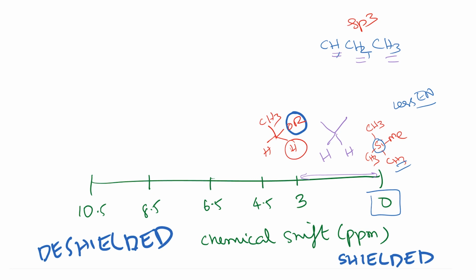So, this is the region where typically olefins show up. Okay. So, where you have R, H, H, R. Okay. So, these hydrogens which are attached to an sp2 carbon typically show up between 4.5 and 6.5. Okay. So, again you can understand that sp2 carbons are more electronegative, and so they are going to pull electrons from the hydrogen and make it more de-shielded.